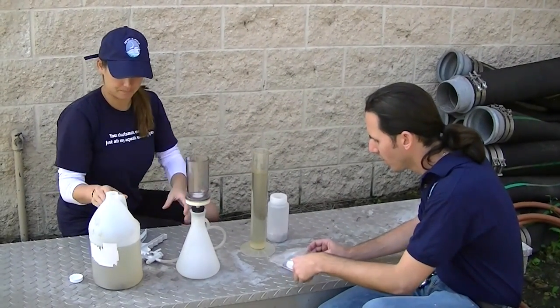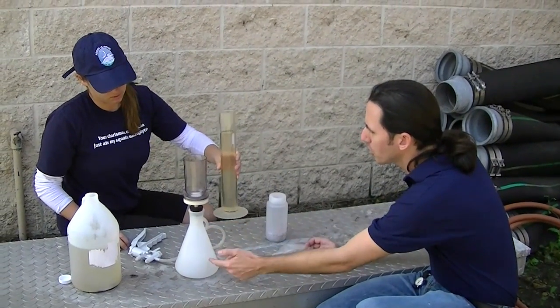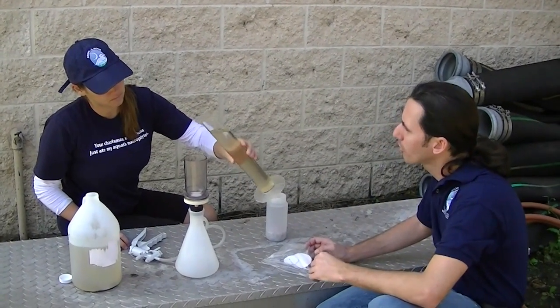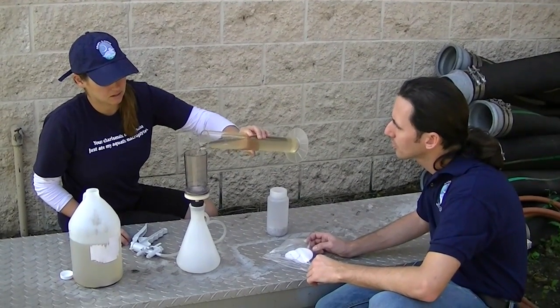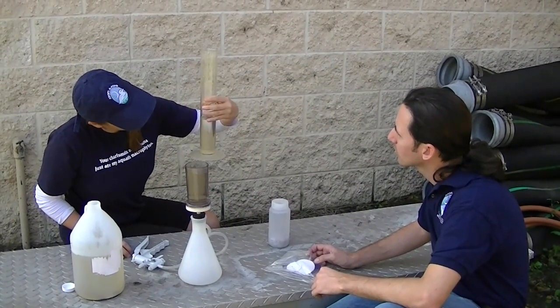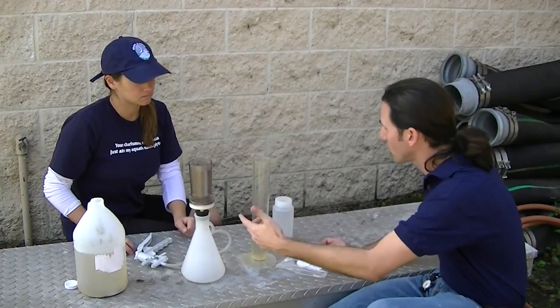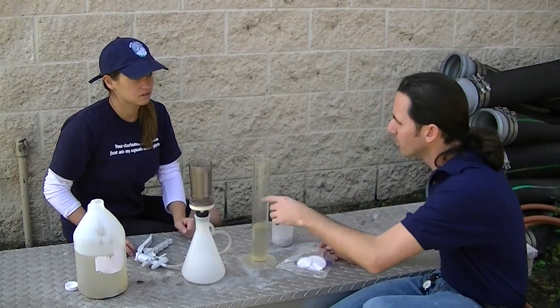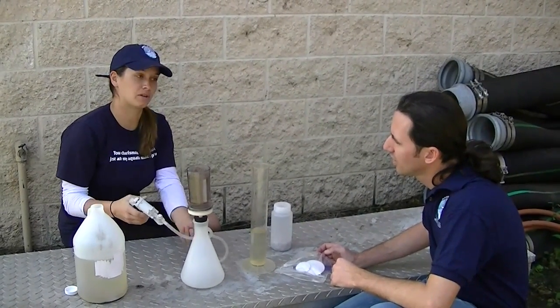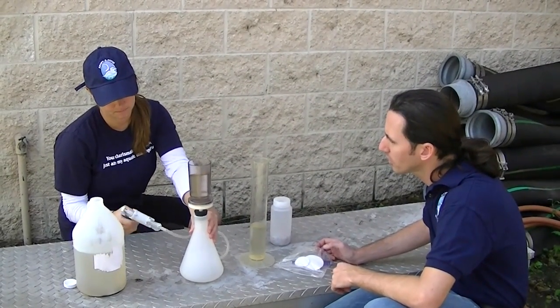Now we're going to pour the water into this cylinder and then use this hand pump to filter it through the paper. Make sure you fill it up and then record how much you've used off of the graduated cylinder. So we have 500 down to about 200, meaning we've got 300 milliliters of water in here. If we filter all of that, we write it down so the lab knows how much volume of water we used to get that amount of algae. Go ahead and start pumping — it just pulls the water down through into the bottle, and the filter is small enough that it will catch the algae.